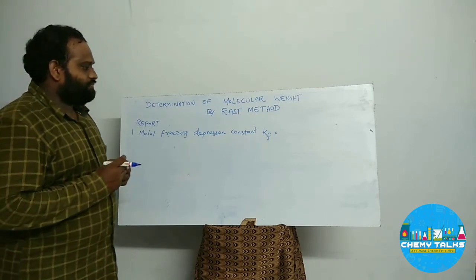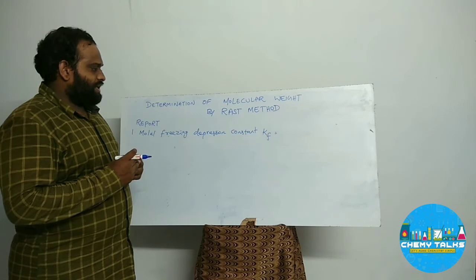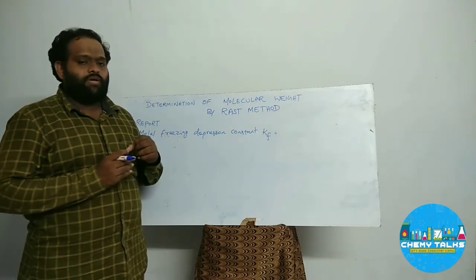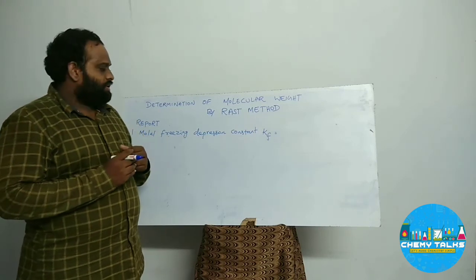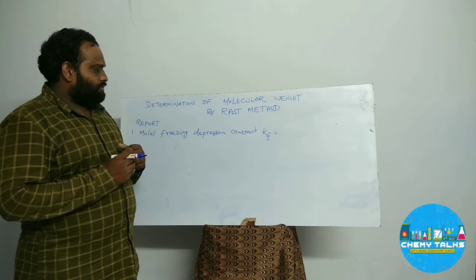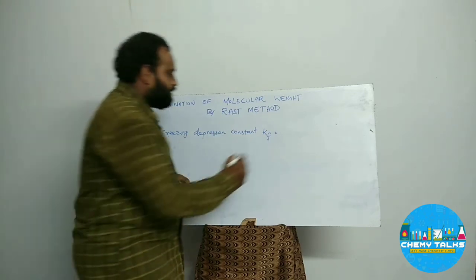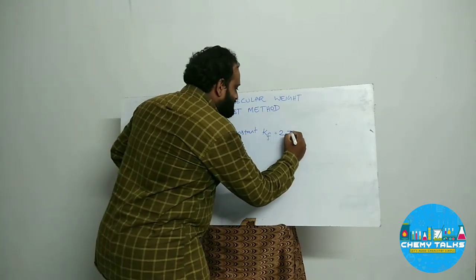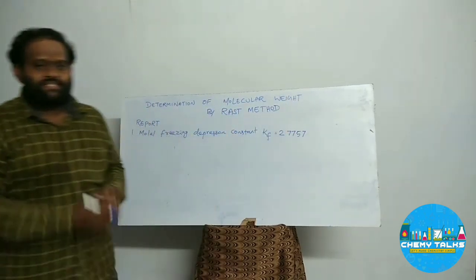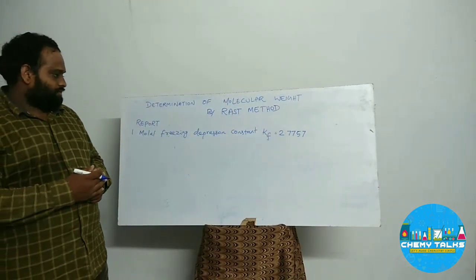From the first addition, that is 5 gram of solvent and 0.5 gram of solute, we have obtained the Kf value of 2.7757.